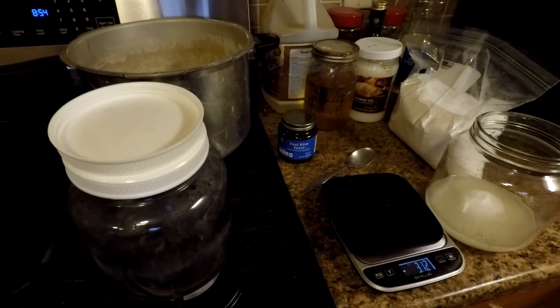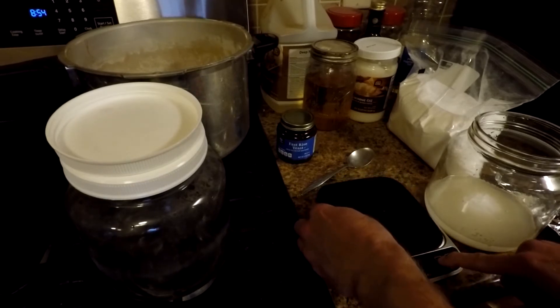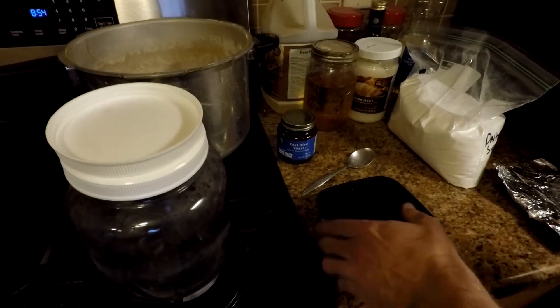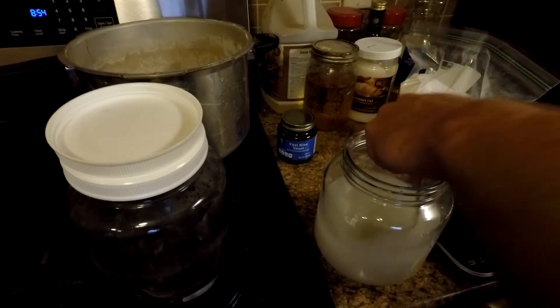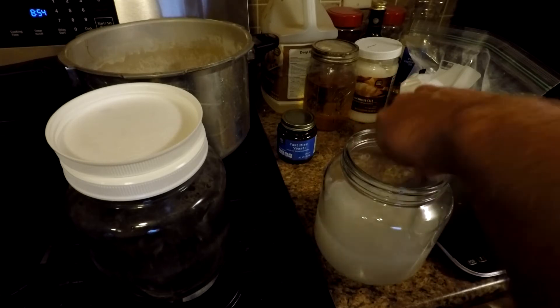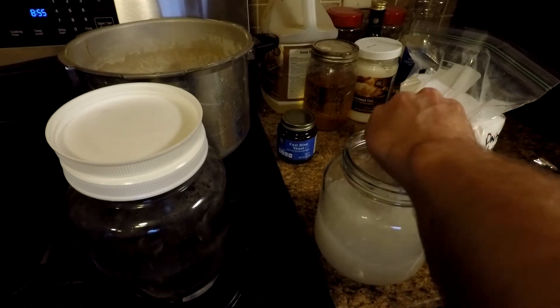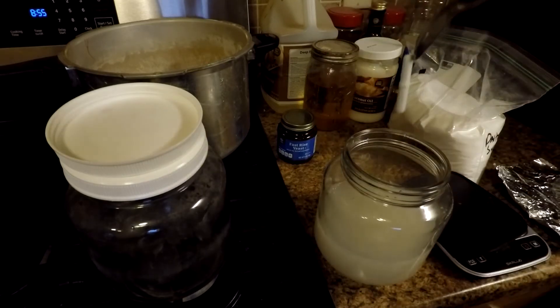I'll rinse that off and reuse the same foil to put over the top of the lid when I cook it. I'll fill this jar halfway up with lukewarm water and give it a mix with a spoon, making sure nothing is clotted up in the corners. You can see the magnetic stir bar sticking to the spoon.